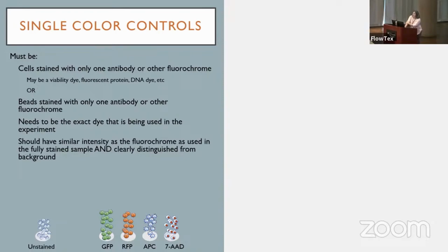You should do it every time because it's how the instrument measures it at the time that you use the instrument. So under your current experimental conditions. The things that can change in an experiment day to day, the cytometer can change. Most modern cytometers do have QC programs that do some adjustment for the minor variances on a day-to-day behavior basis. But unless you are really well in tune with what those are and how well they're functioning, you shouldn't assume they do. The second is the dyes in the cells that you use also can change over time.